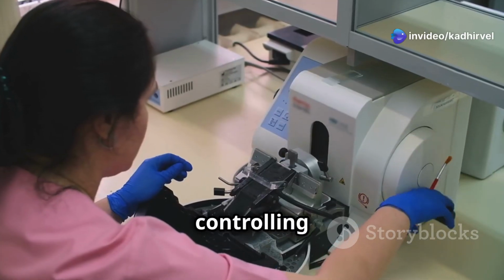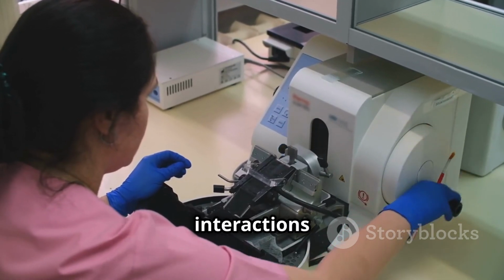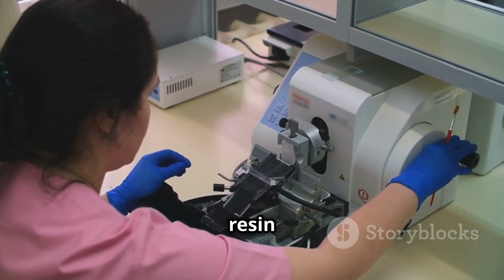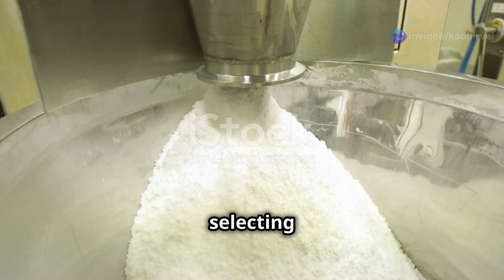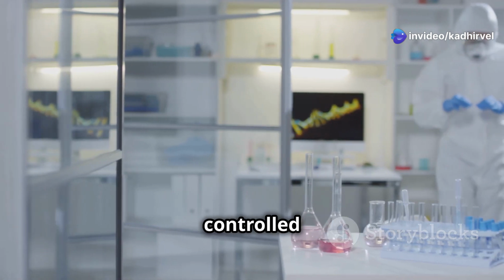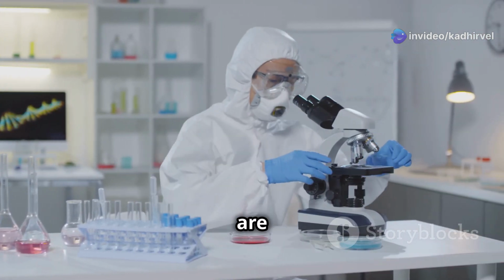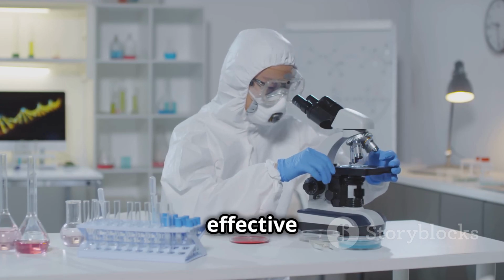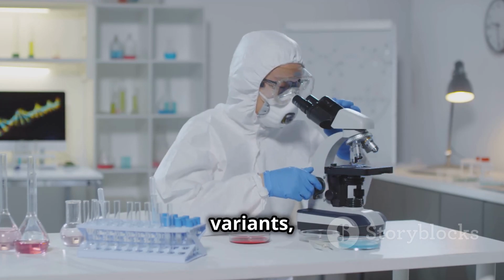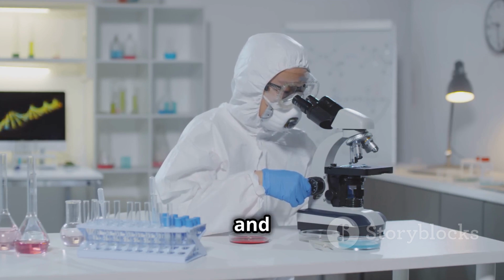The chemistry behind controlling acidic variants in CEX involves fine-tuning the ionic interactions between the negatively charged resin and the differently charged mAb forms. By carefully selecting the buffer pH and applying a controlled salt gradient, acidic variants with lower positive charge are selectively eluted before the main mAb peak. This enables effective removal of acidic variants, resulting in a purified mAb product with improved quality and consistency.